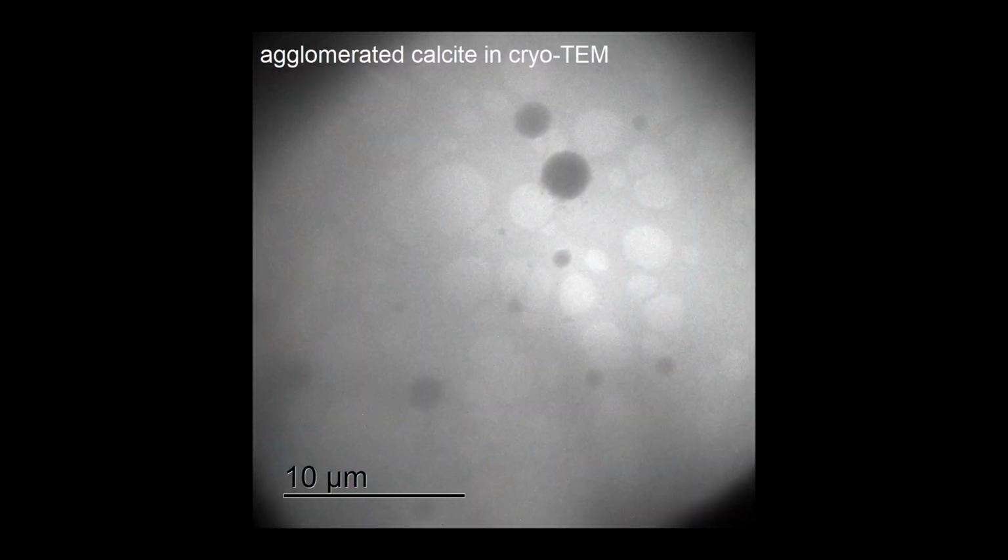Okay, and calcite is calcium carbonate, a certain crystalline form of calcium carbonate. Exactly. It's agglomerated in a certain way that it scatters the light, and that blue is what reaches your eye. Exactly. And you detected this with the cryo-electron microscope.